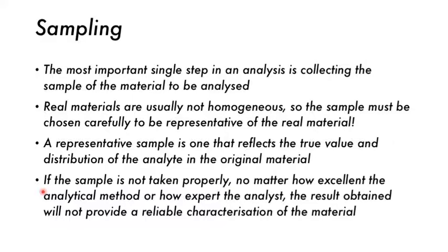We want to know how much salt is in our food maybe, or how much of a particular preservative is present, which means that we need to get that in an analyzable form, because if you just get a piece of, I don't know, frozen vegetables or frozen meat or something, how do you analyze that? You have to sample it in some way.